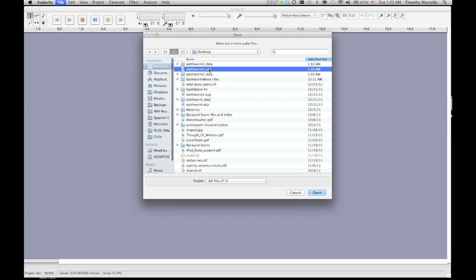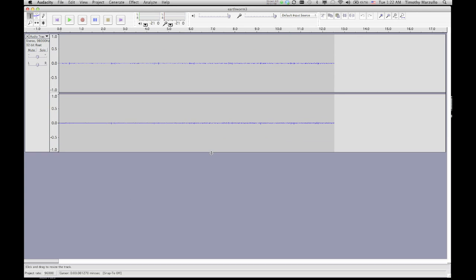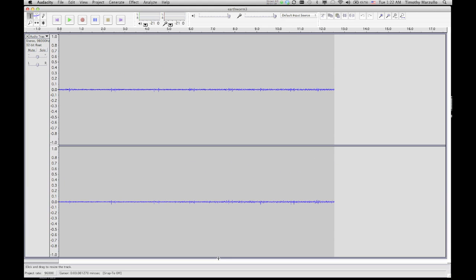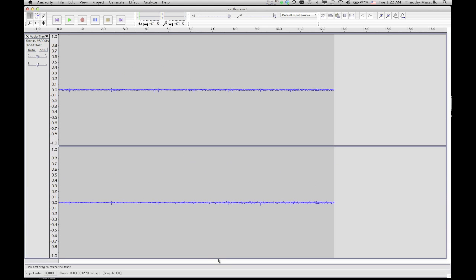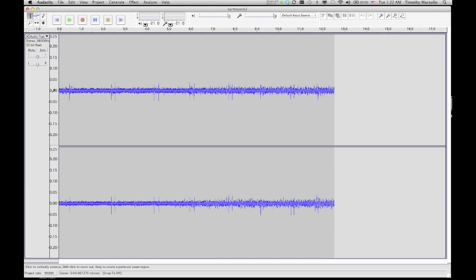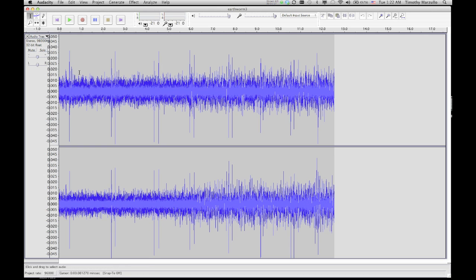I'm opening up the recording I just made, and again, maximizing the window and zooming in on the y-axis so I can see the spikes clearly. You can see about 15 spikes in the recording. Let's listen again.